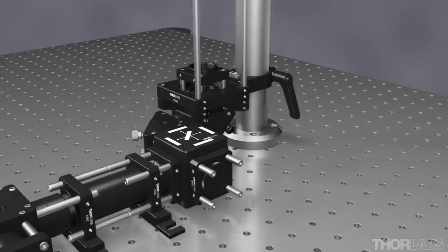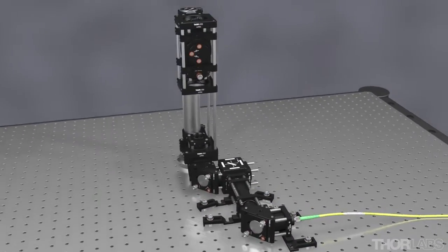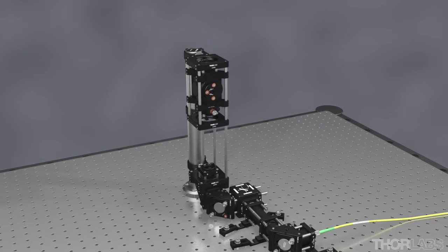Use the clamps that are included with the kit to secure the beam expander module to the optical table. When properly mounted, the beam expander module should not be pulled up off the table.